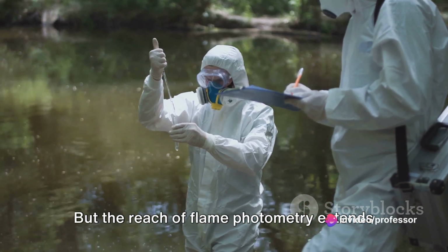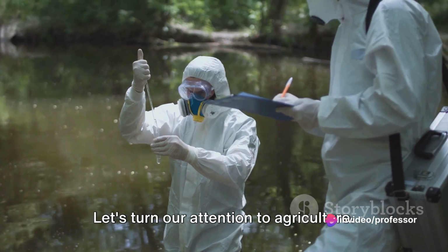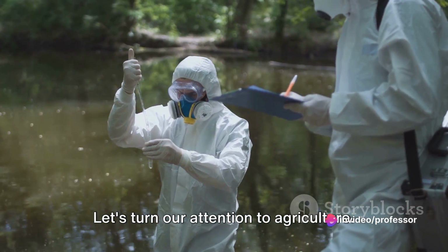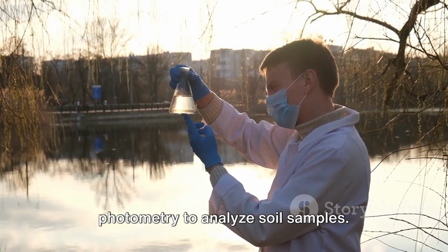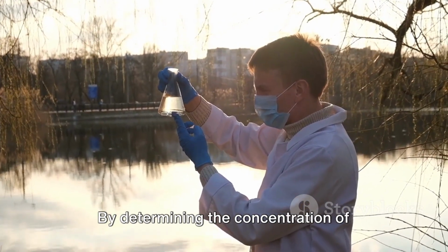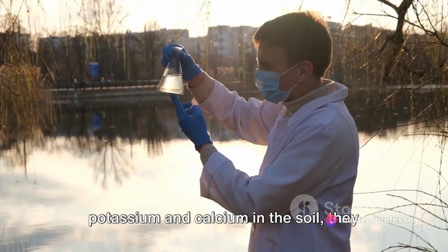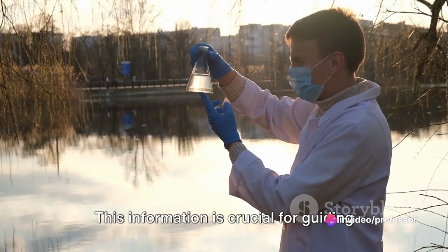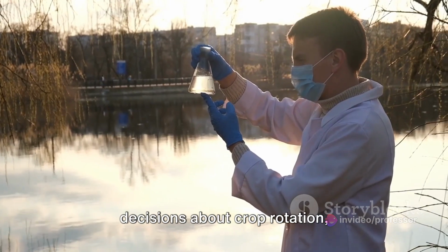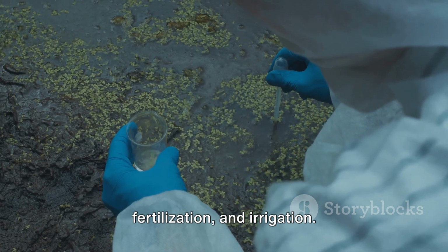But the reach of flame photometry extends far beyond healthcare. Let's turn our attention to agriculture. Farmers and scientists use flame photometry to analyze soil samples. By determining the concentration of potassium and calcium in the soil, they can assess its health and fertility. This information is crucial for guiding decisions about crop rotation, fertilization, and irrigation.